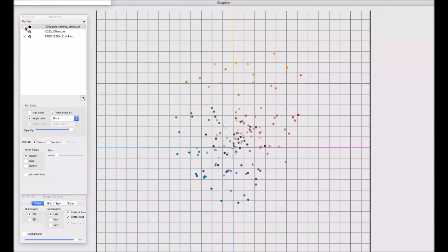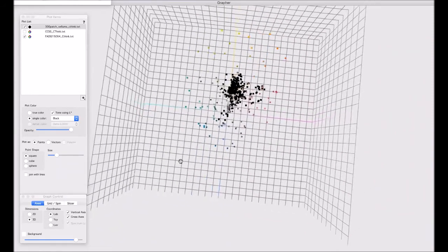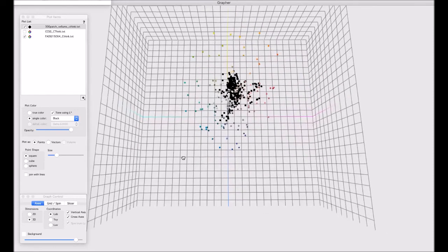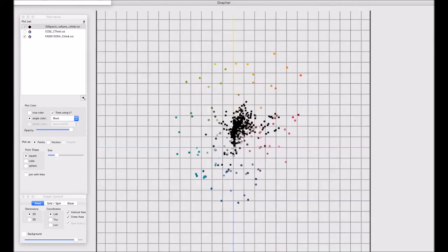I'll just show this finally in a 3D mode, so there they are again. We didn't do it specifically for parchments and vellums because there are other kinds of colors in most collections. So at this point, I will just go back into the 2D mode to make things stable, and we will conclude this small little movie.